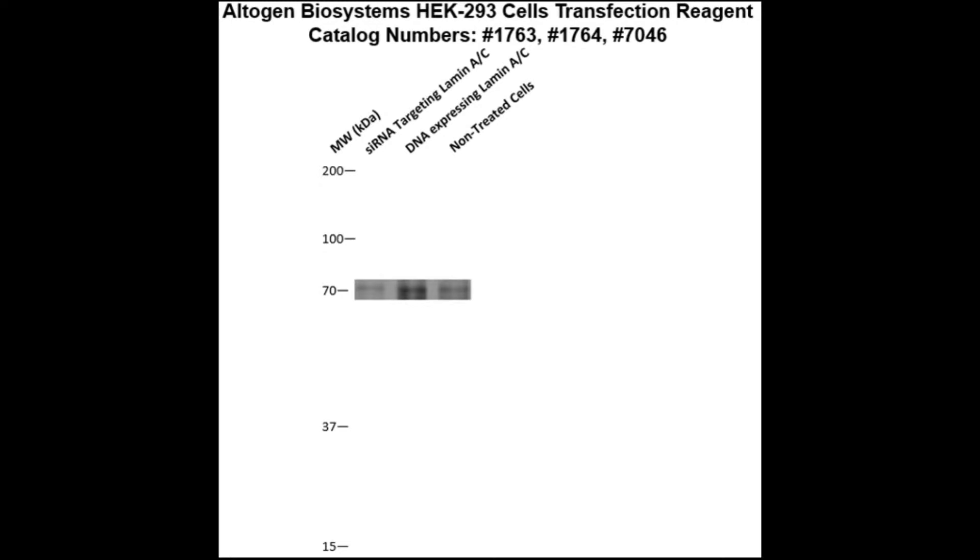Here is a Western blot validation of our transfection reagents. HEK293 cells were transfected with either Lamin-AC DNA, which resulted in overexpression as compared to non-treated cells, or Lamin-AC siRNA, which resulted in partial silencing.